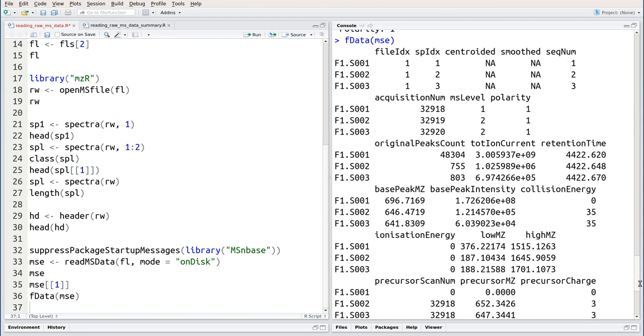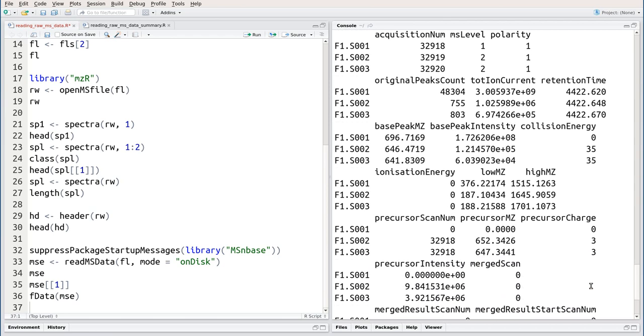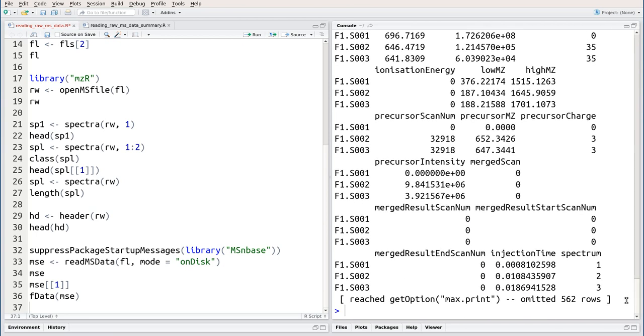The big difference here is that this MSNX object contains all the data and encapsulates the raw spectra and the annotation all together.